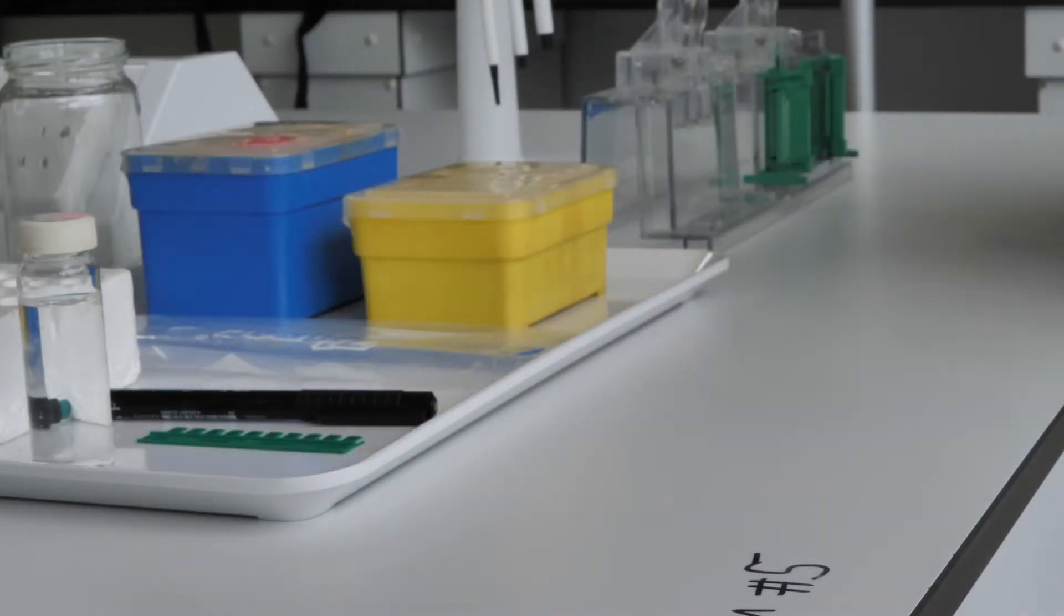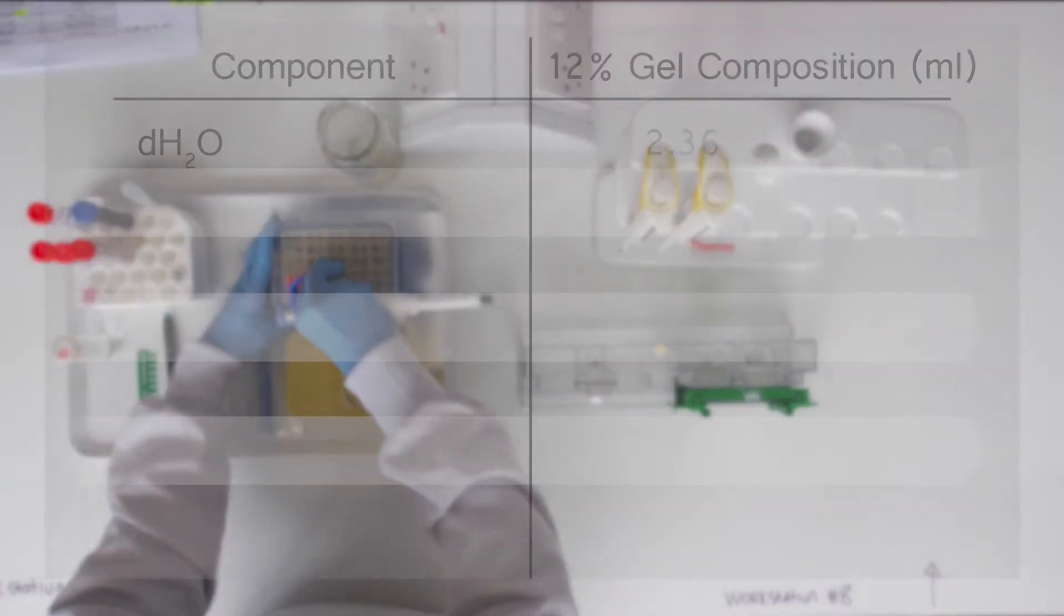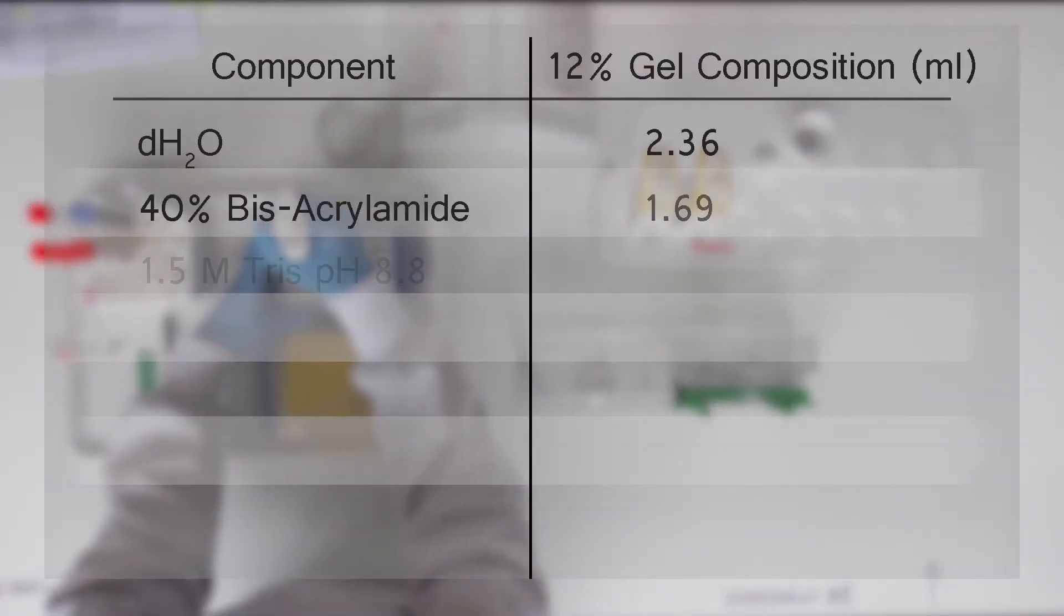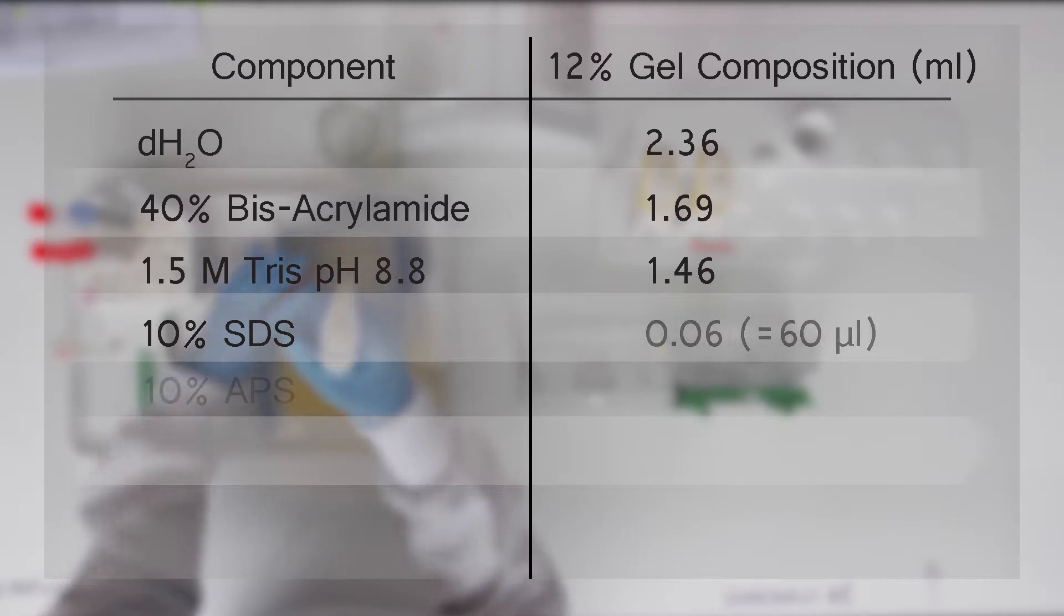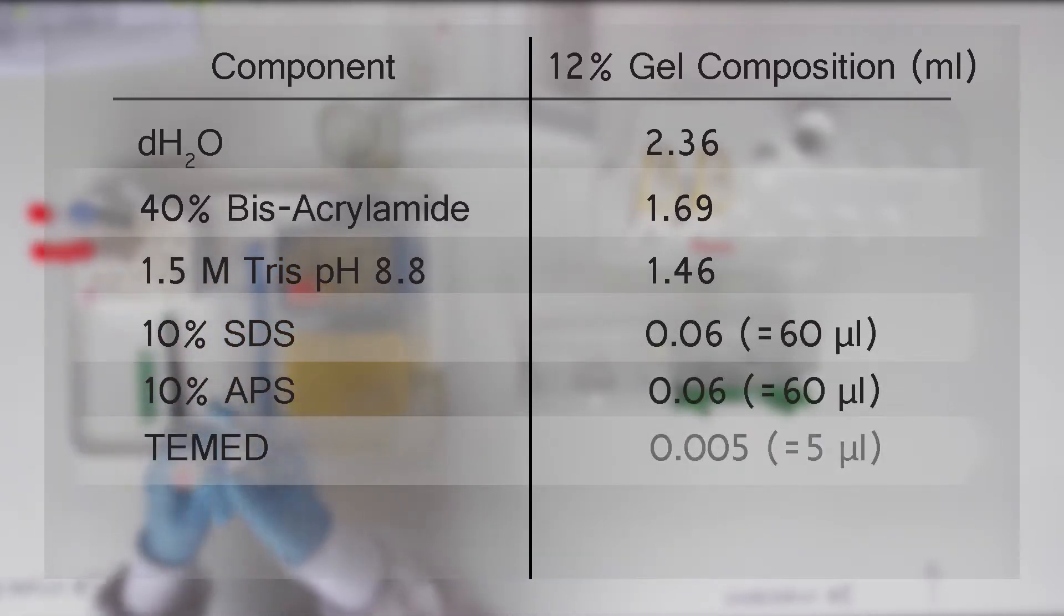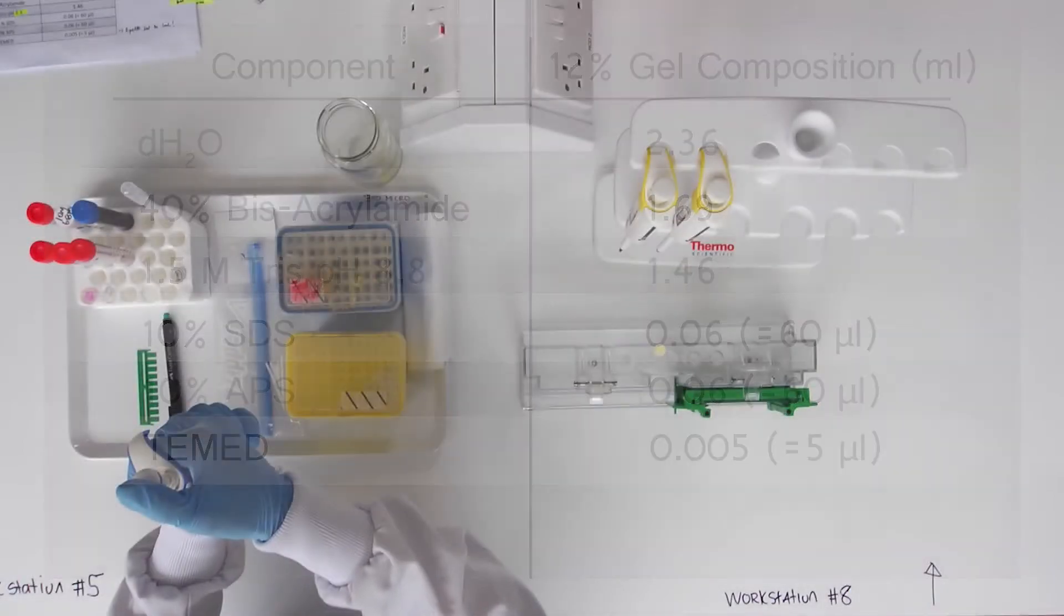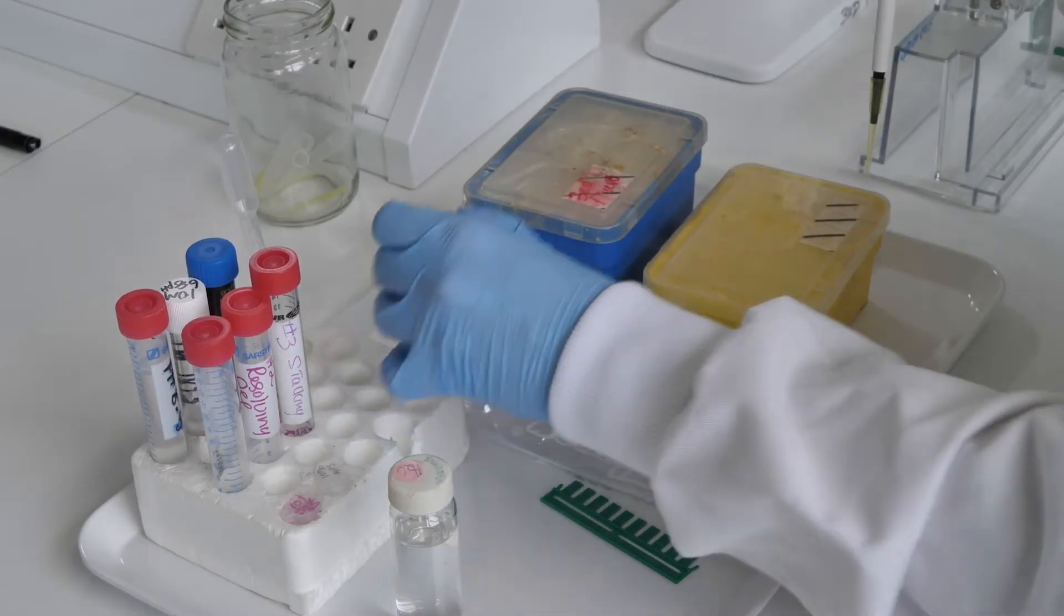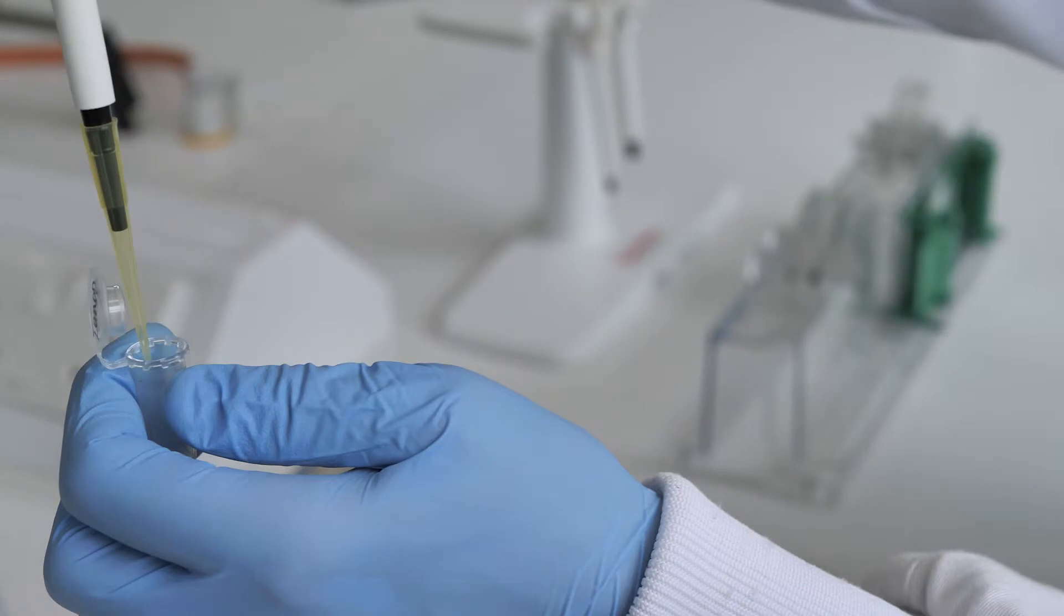Next, prepare the resolving gel according to the recipe shown here. Notice that the volumes are given in mL rather than µL. Again, the TEMED is added last.